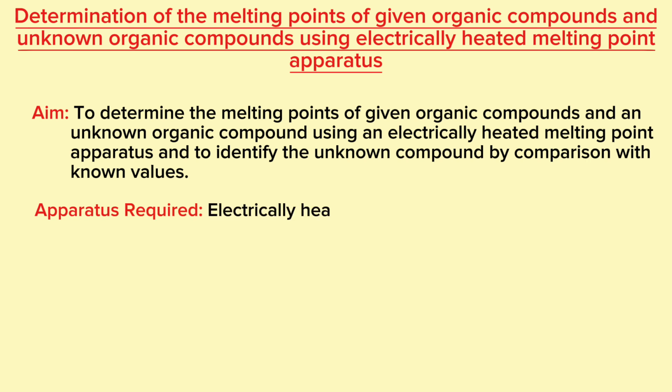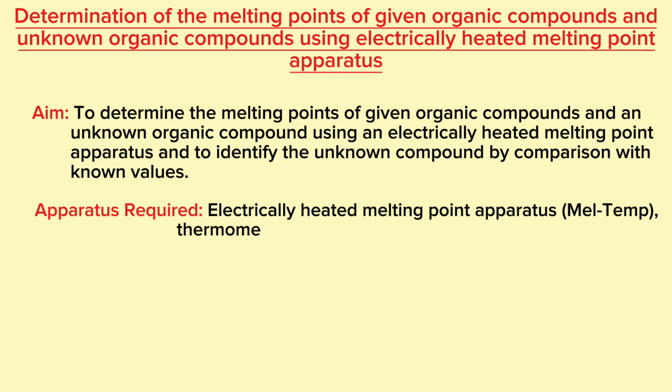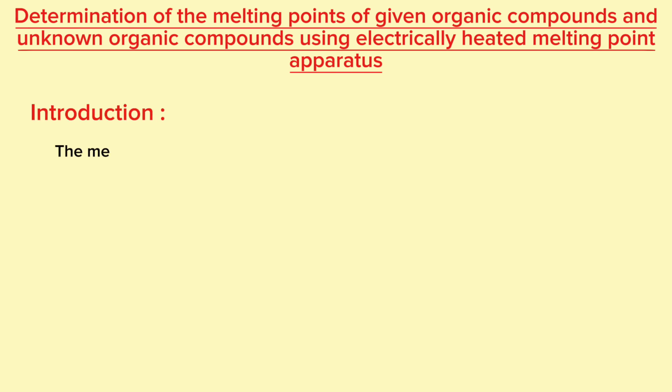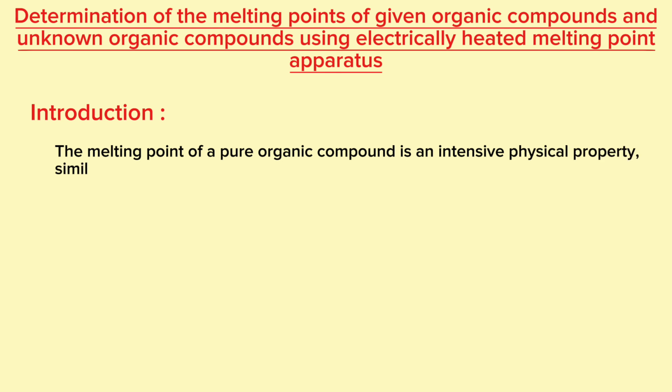Apparatus required: electrically heated melting point apparatus, MEL-temp, thermometer, capillary tubes, organic compounds, known and unknown, mortar and pestle, weighing boat. Introduction. The melting point of a pure organic compound is an intensive physical property.